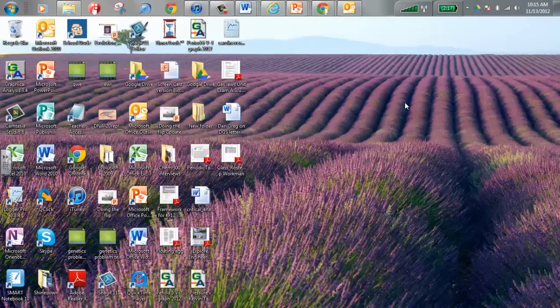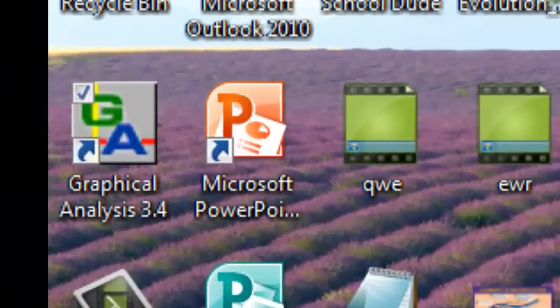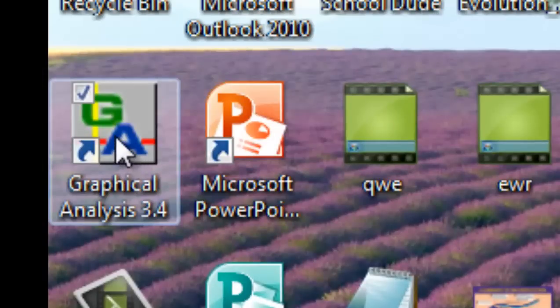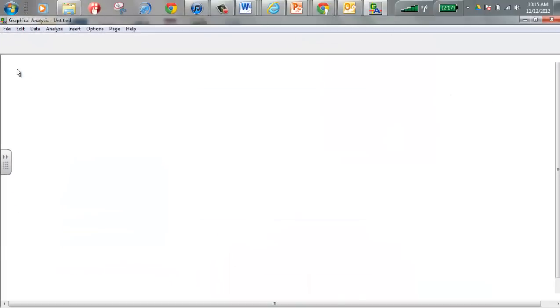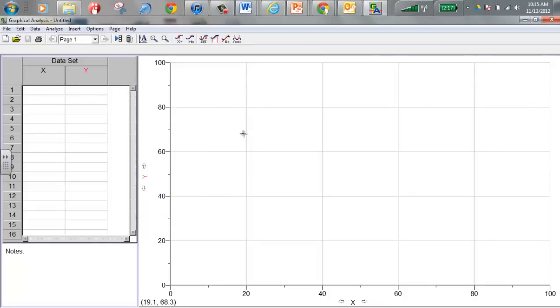It's an older version of Graphical Analysis but it does work in case you want to make some graphs at home in your spare free time. This is Graphical Analysis here. You're going to go ahead and double click on it. The first time you log in and open it up, you're going to see installation, it's going to go through some installation processes. Let it do that.